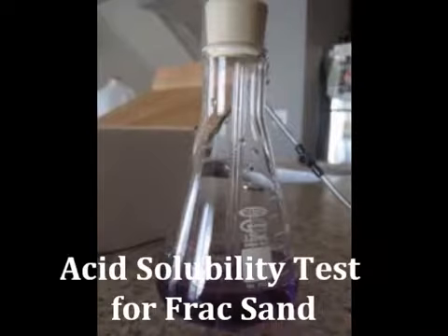Do you have frac sand? Possibly. Let's talk about one of the tests that you need to run on your sand to determine if it is high enough quality to be used for hydraulic fracturing. That test is the acid solubility test, and this is a test that figures out if you have undesirable contaminants in your sand. Some examples of those contaminants would be carbonates, feldspars, iron oxides, or clays.